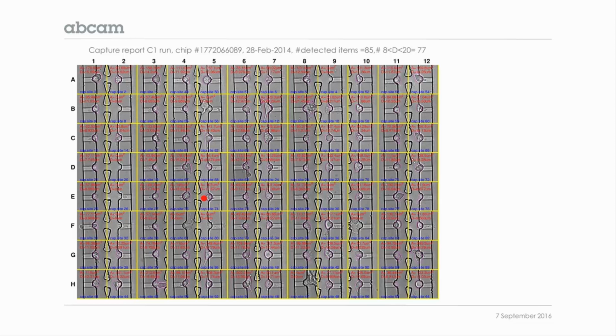But other than this, today there are other protocols, not the protocol that I described, that can do DNA sequencing and RNA from the same cell, DNA and methylation, RNA and methylation, and other combinations of protocols that can take measurements on a single cell and get more than just the RNA.